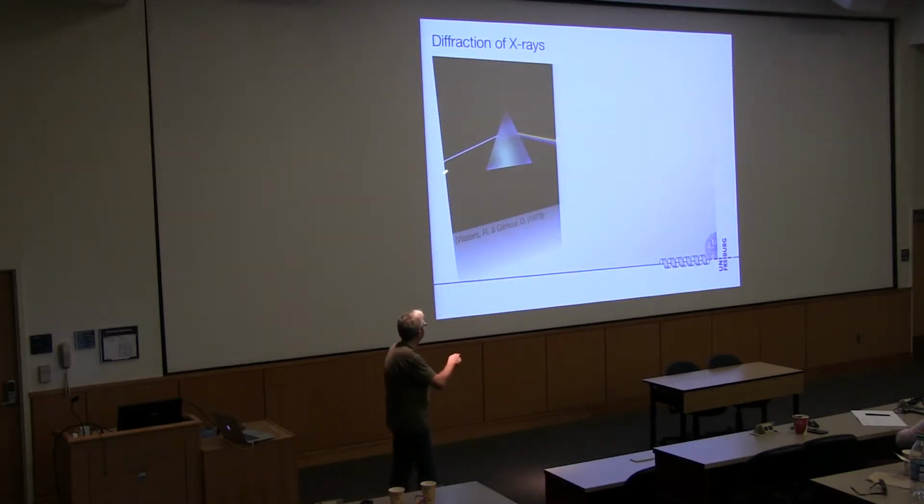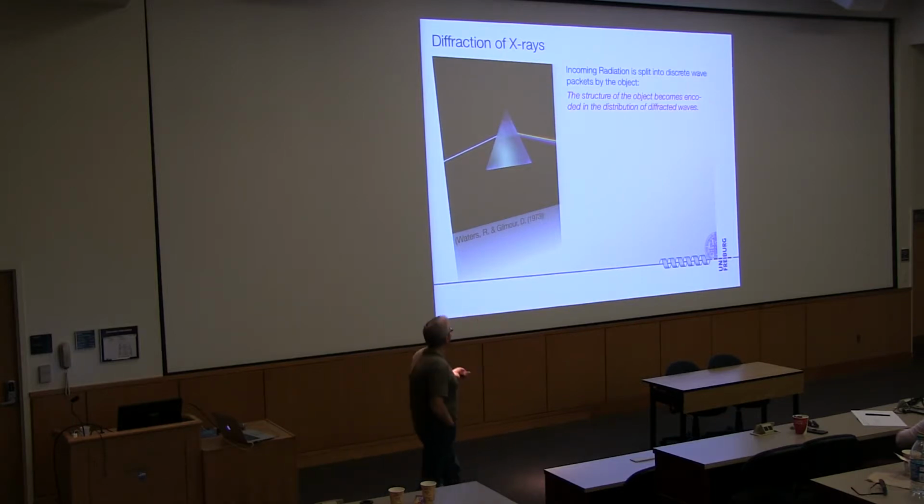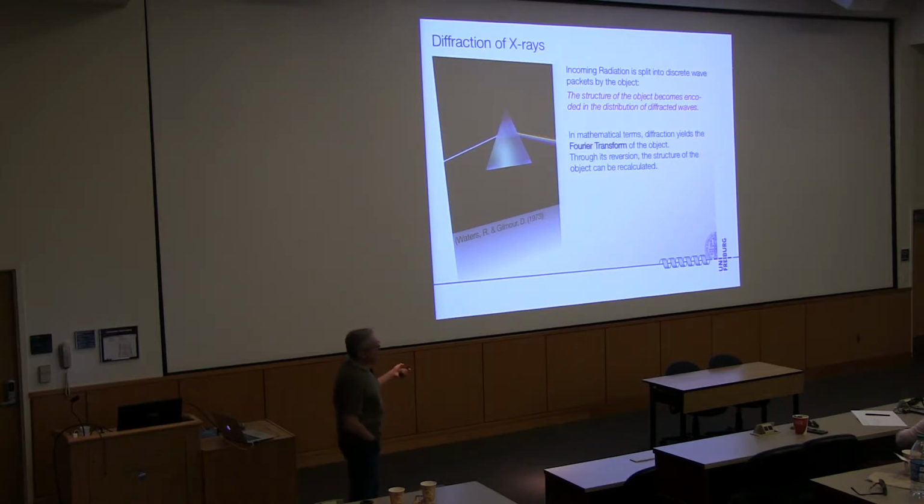prism or something. Right? It's basically, here it's just the, well, let's say the optical density that then leads to a differential diffraction of different wavelengths in a prism. No? And the information about the substance that builds this prism is basically encoded in the distribution, in the spread of the energies, the different energies of the white light that you put in. No? So we have an encoding of the structure in that object, and the actual process that happens is a Fourier transform.